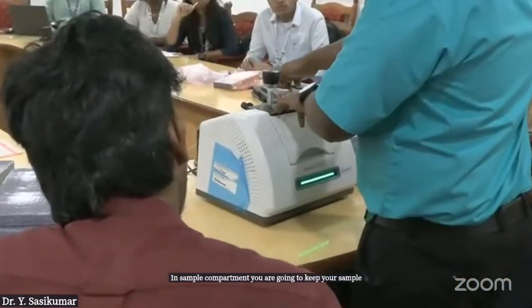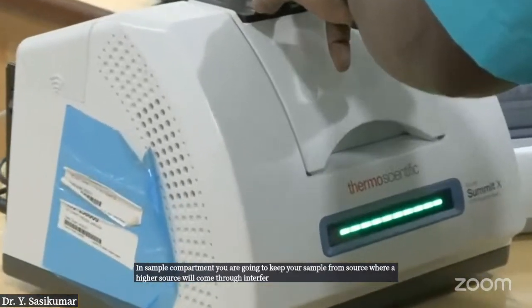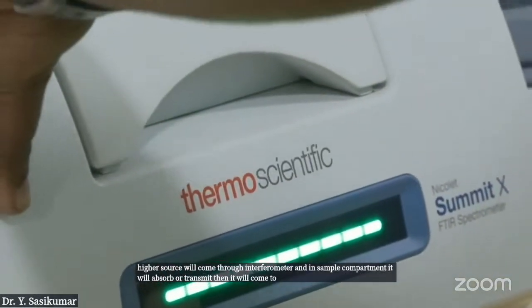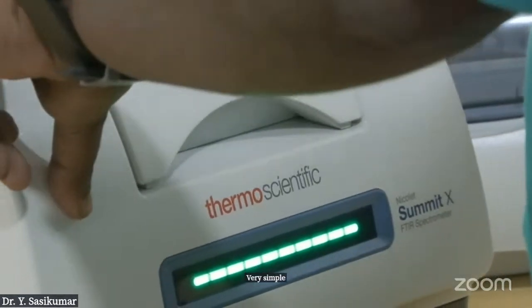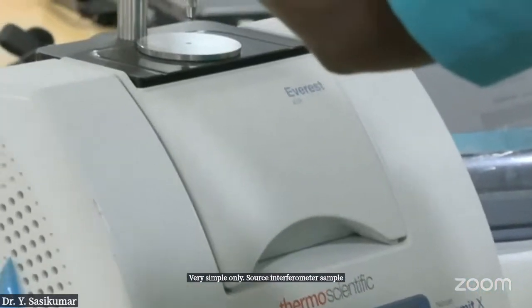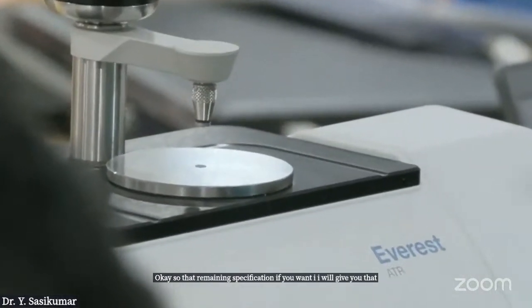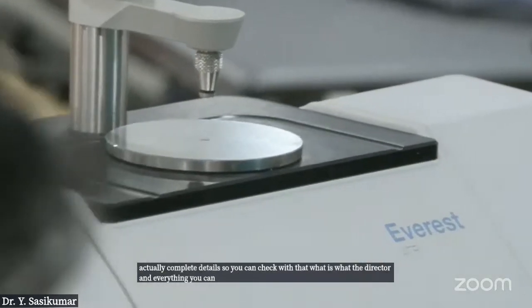From the source your IR radiation will come through the interferometer, and in the sample compartment it will be absorbed or transmitted, then it will come to the detector. Very simple only. So source, interferometer, sample compartment, detector. If you want the remaining specification, I will give you the complete details, so you can check the detector and everything once.